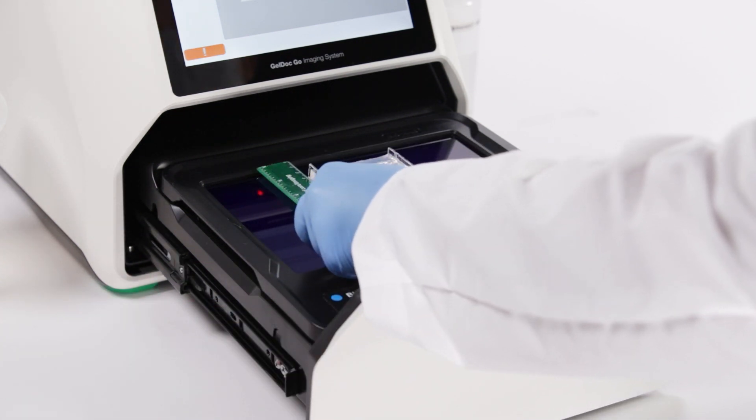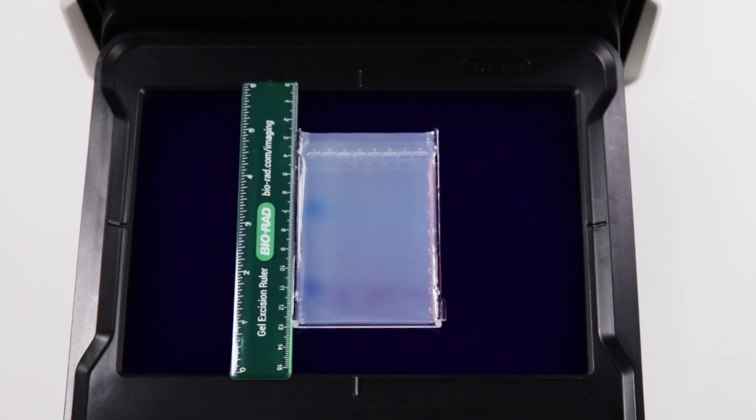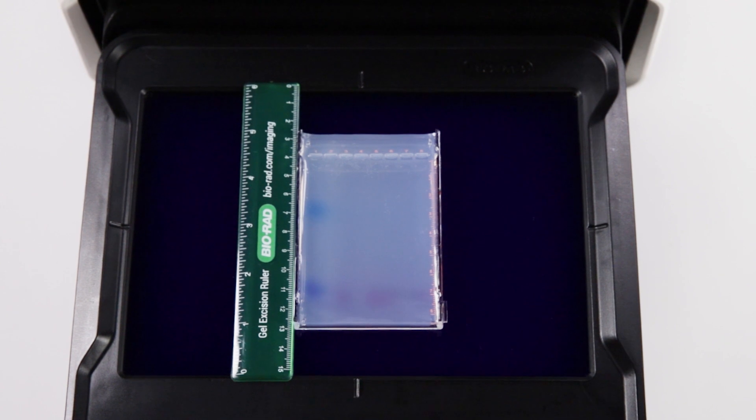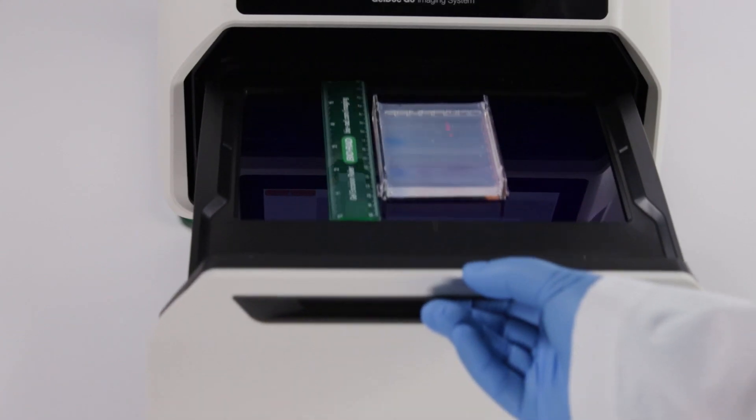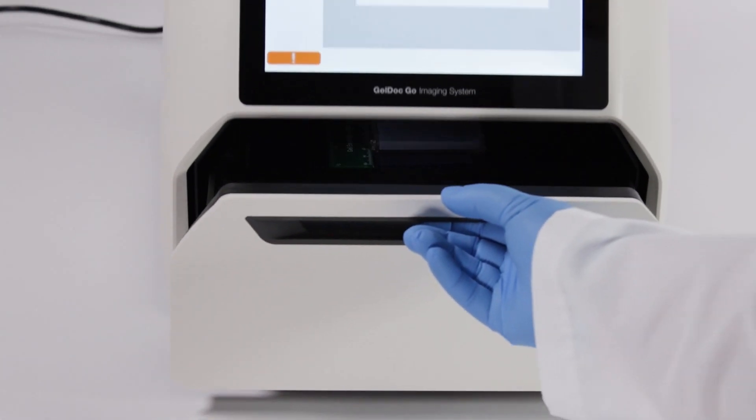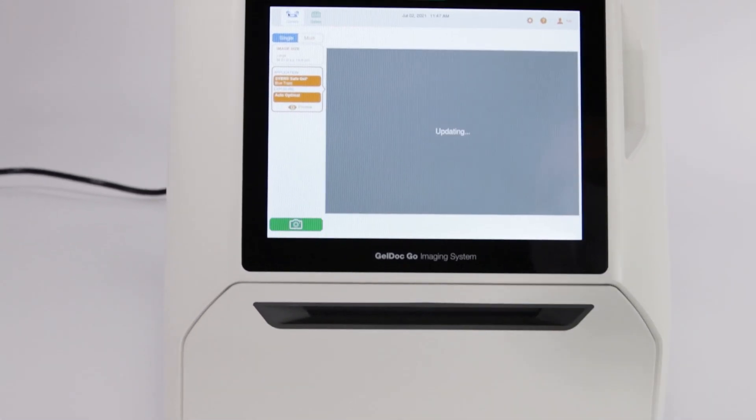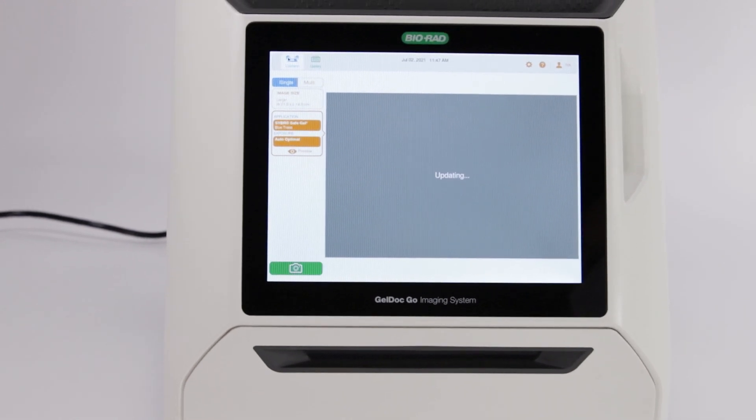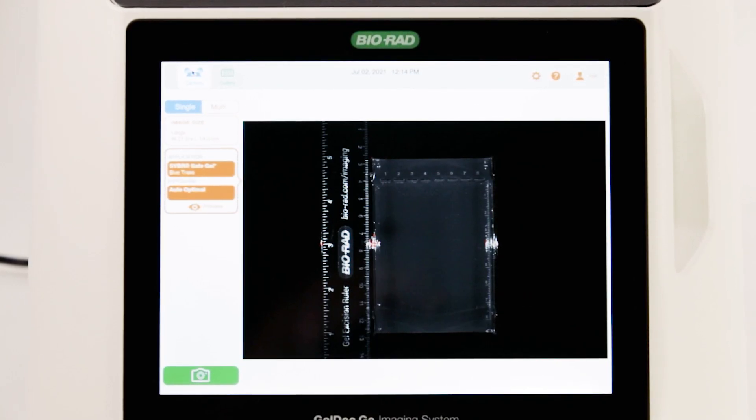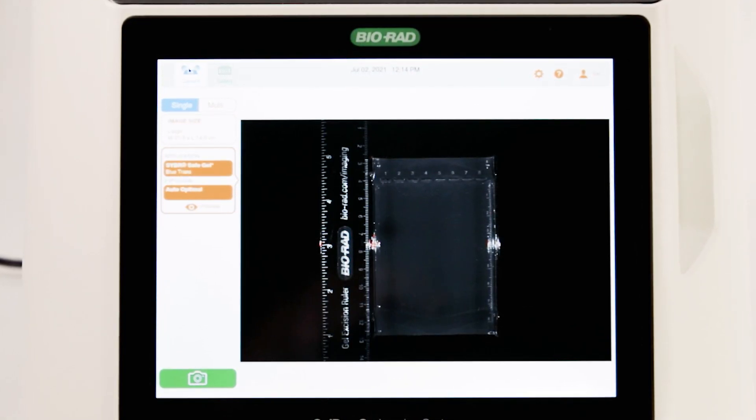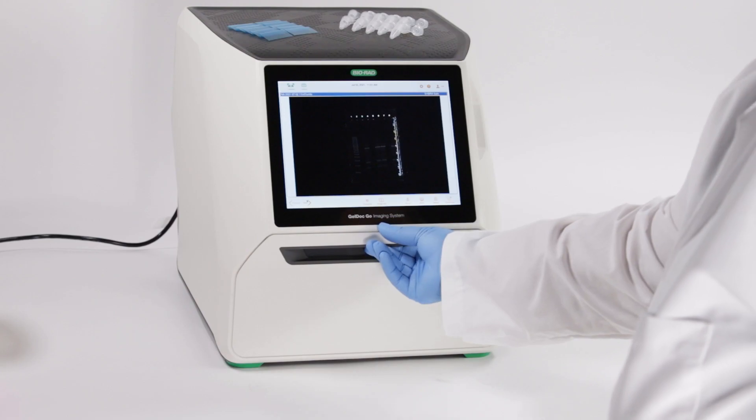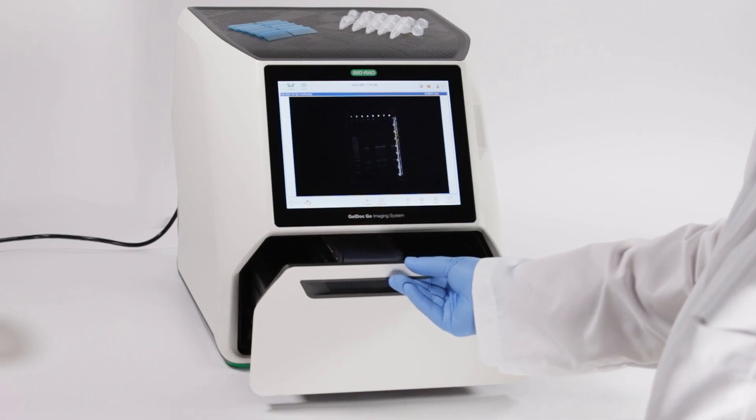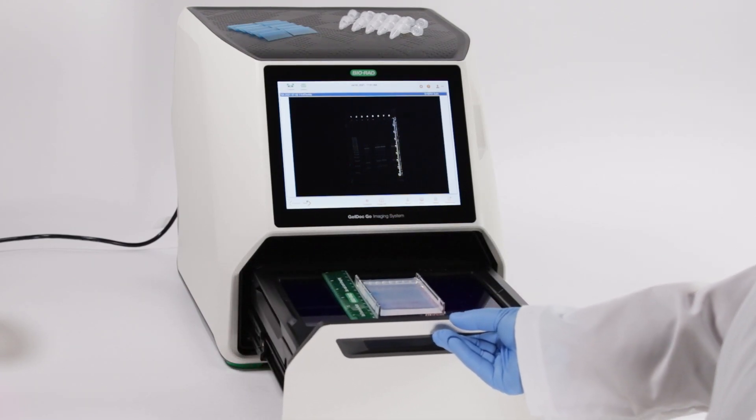Acquiring an image is quick and easy on the Gel.Go system. Make sure to follow the instructions for your instrument when imaging. The Gel.Go blue tray can be used to locate bands without risking UV crosslinking. The ruler can be used as additional help to know you have selected the correct band for excision.